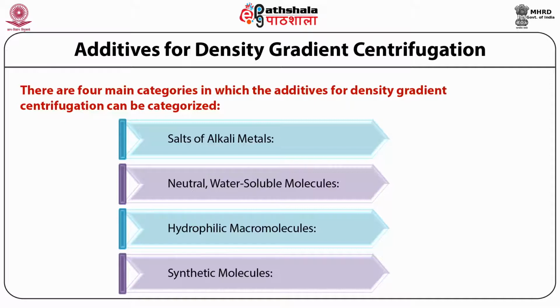Due to its high osmotic pressure, sucrose solution dehydrates cells and their organelles very efficiently. Glycerol solutions are the preferred media for the separation of enzymes because they do not affect enzyme activity. They exhibit high viscosity and require prolonged centrifugation time. More importantly, however, glycerol penetrates the biological membrane.